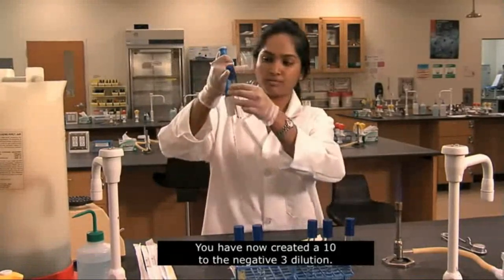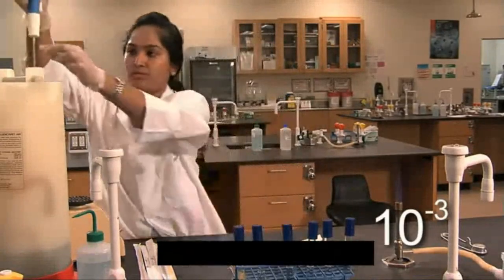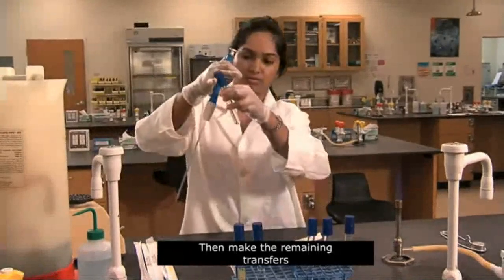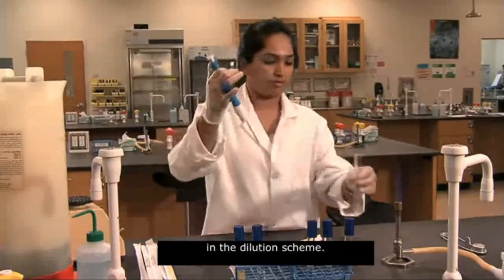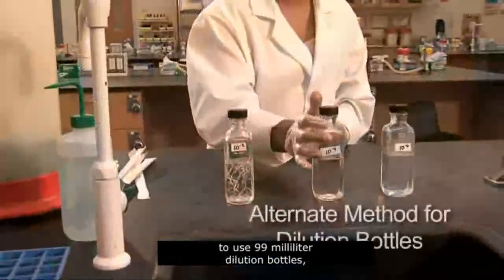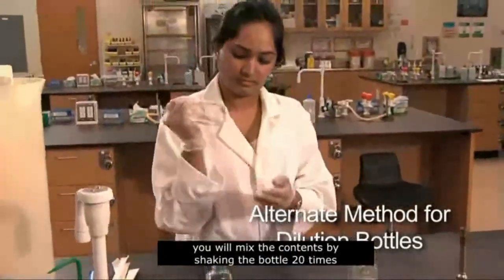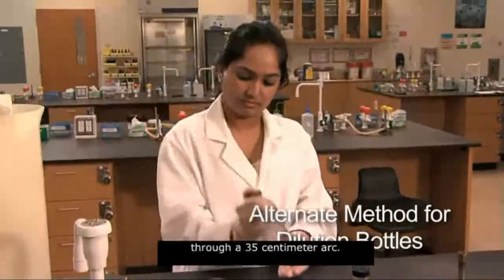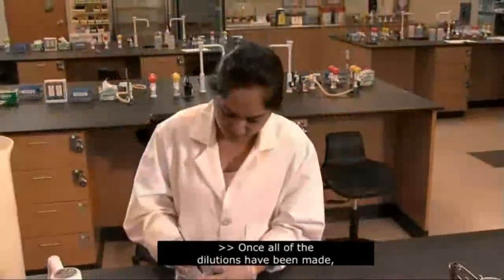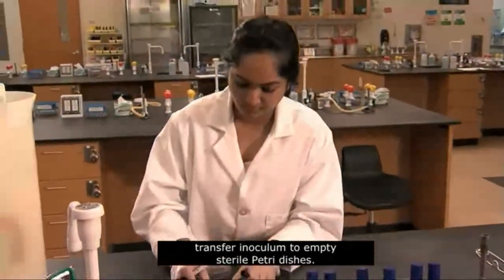You have now created a 10 to the negative 3 dilution. Then, make the remaining transfers in the dilution scheme. If your dilution scheme requires you to use 99 milliliter dilution bottles, you will mix the contents by shaking the bottle 20 times through a 35 centimeter arc. Once all of the dilutions have been made, transfer inoculum to empty sterile petri dishes.